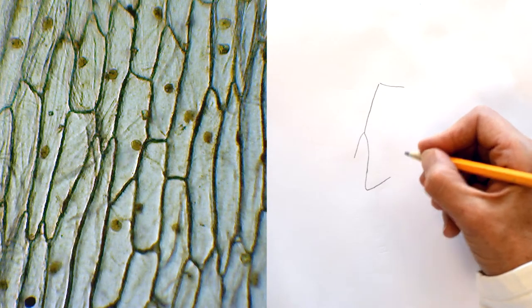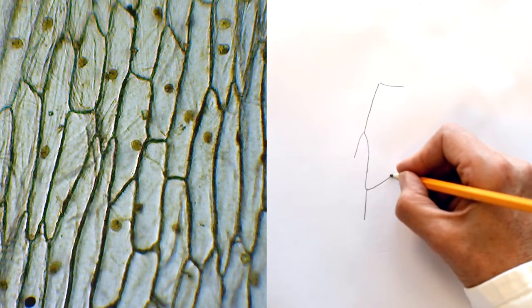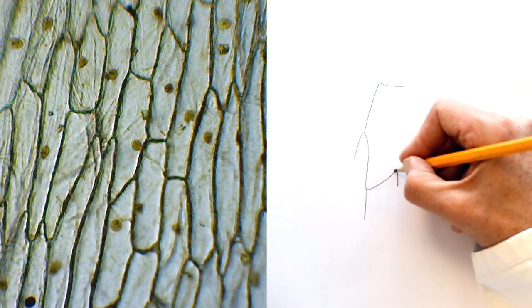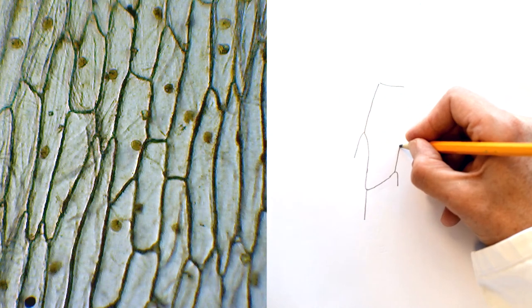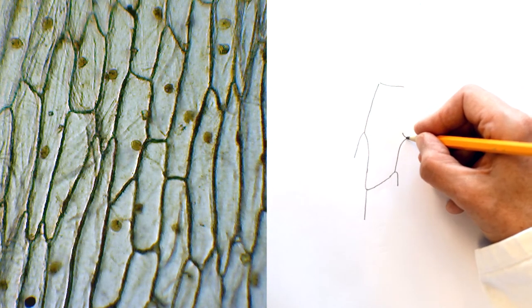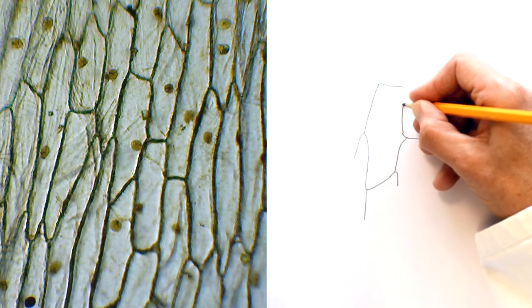Well why is that like that? Well that's because that cell is interacting with two other cells so I'm going to show that as well and now I'm going to work my way back up and as I get towards the top I can see that there's another interaction with another cell at this point and then I can follow through up towards the top.